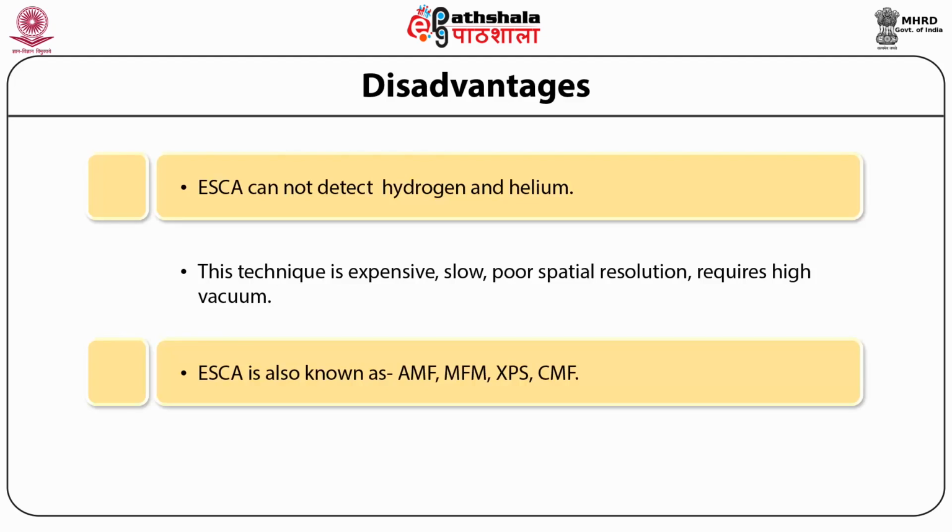Then we go in for a second etching and a third etching, and wherever we find that the percentage of these elements at the surface has gone down to practically zero concentration, we will say that the actual bare surface has come out. And by adding those number of etchings, we can approximately say that the thickness of the layer is equivalent to the total etchings.